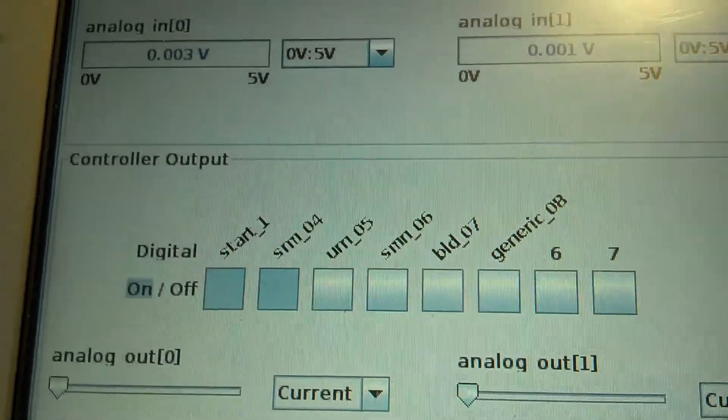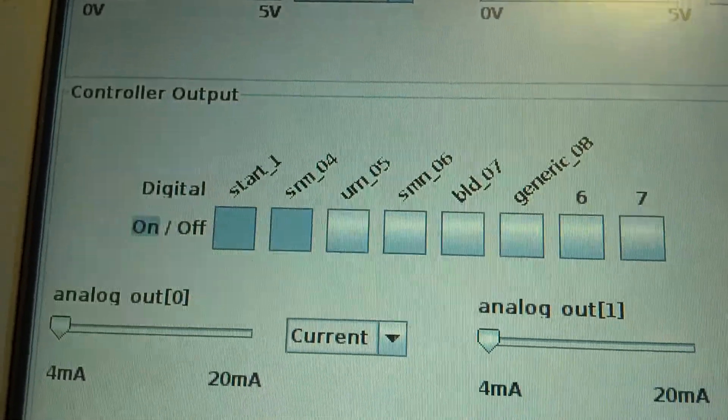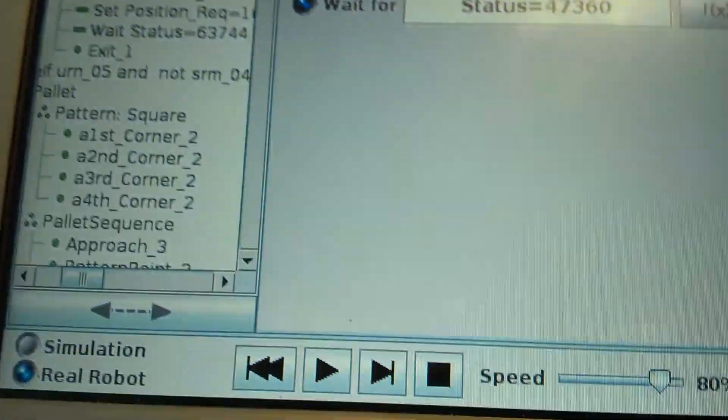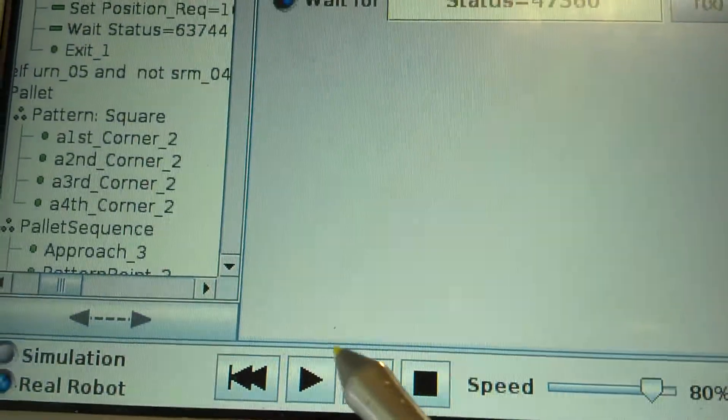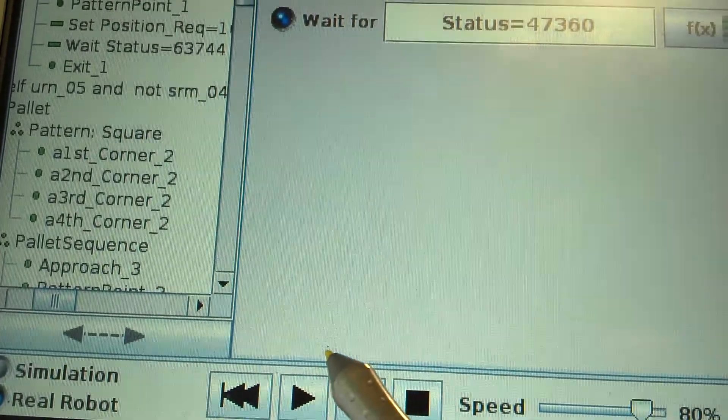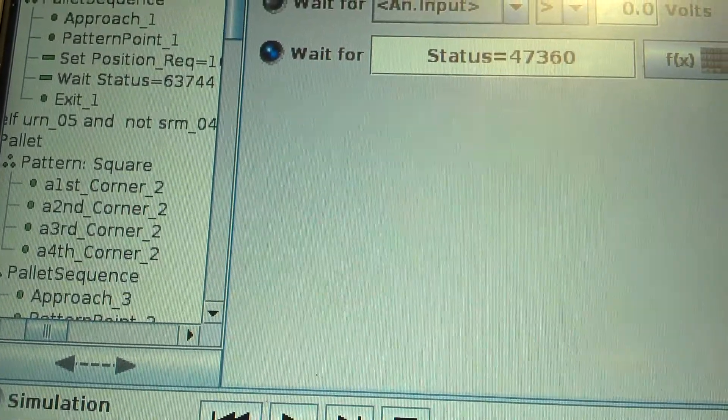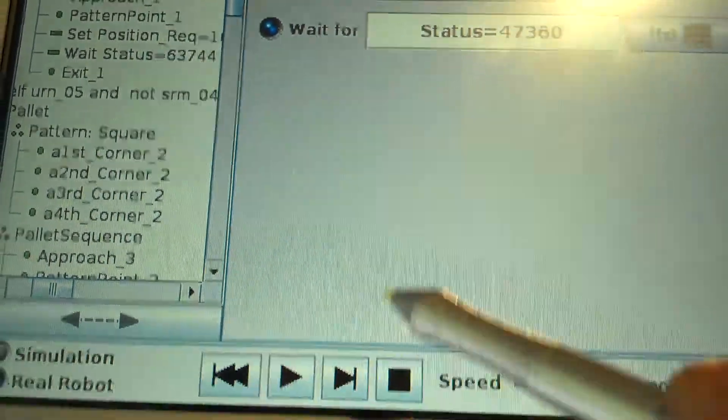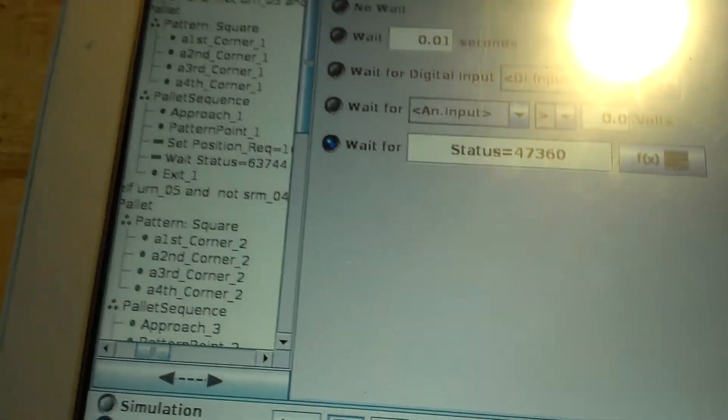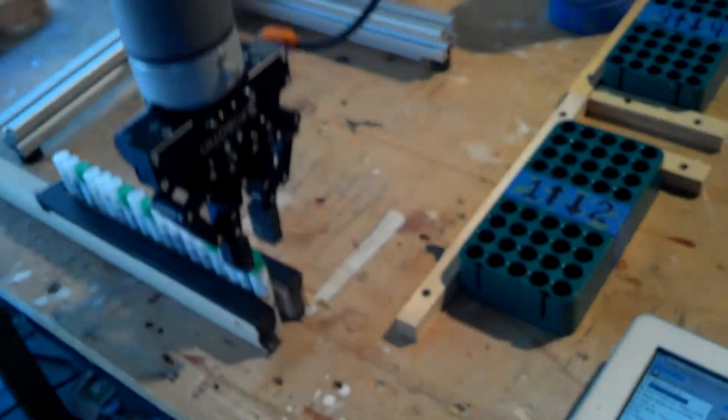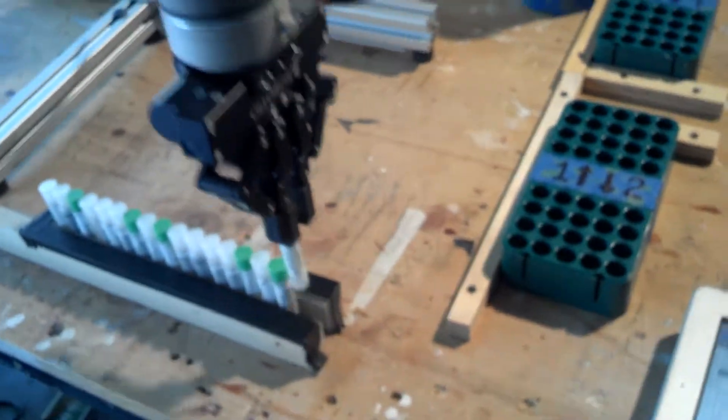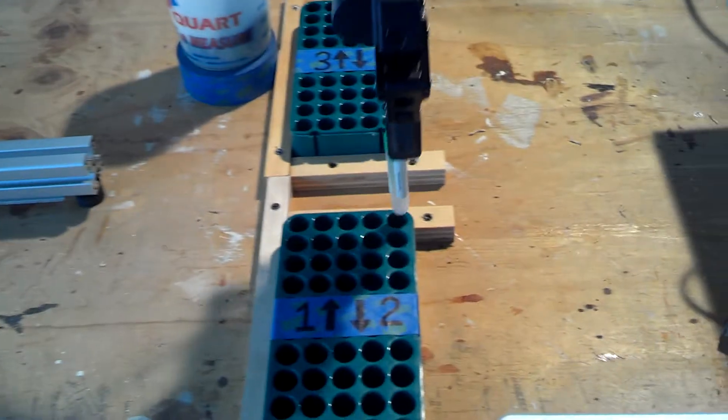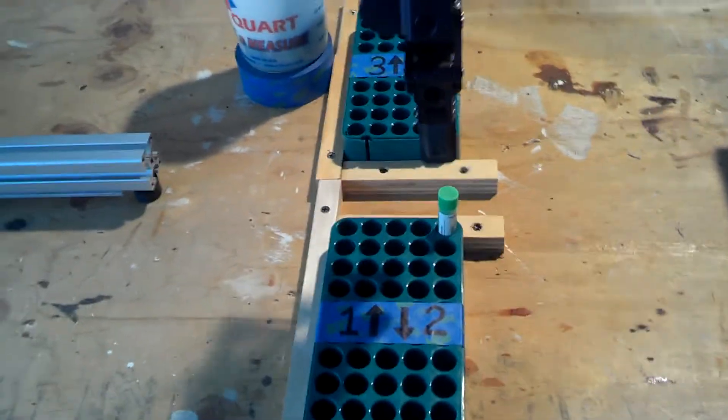Okay, so as soon as I go back to the program and hit start, the robot will pick off, grab the first one, send it to pallet one.